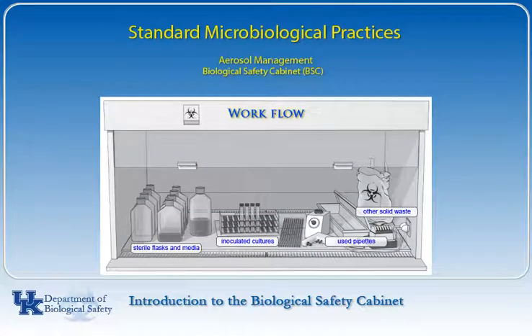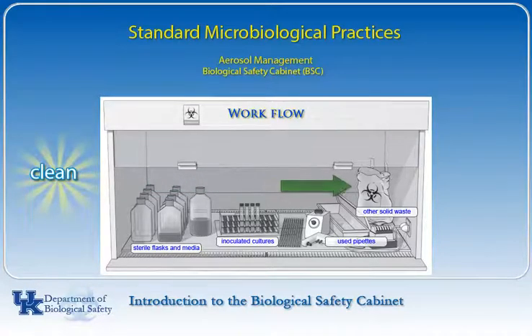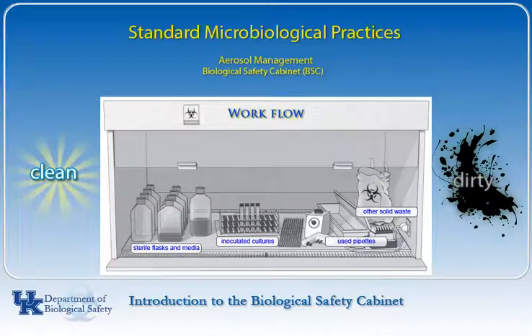Prepare your work with procedures in mind. Arrange the materials within the cabinet in a manner to ensure good aseptic technique. All work flows from one side of the cabinet, clean, to the other side, dirty. Contaminated items never cross over to the uncontaminated clean area.